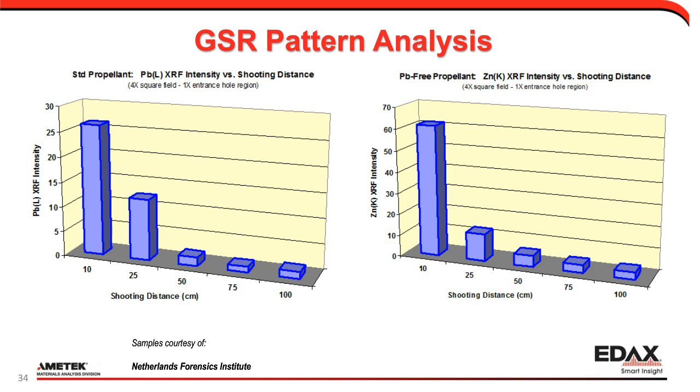So the idea here is to be able to measure the pattern and get an idea of where the distance of the shooting took place using some test fires with maybe the weapon that was found at the crime scene, and then to determine if the data that comes from the test fires is consistent with the crime scene evidence and the alibi given by the victim. For example, you could tell whether the shot took place from a great distance or whether it was self-inflicted.